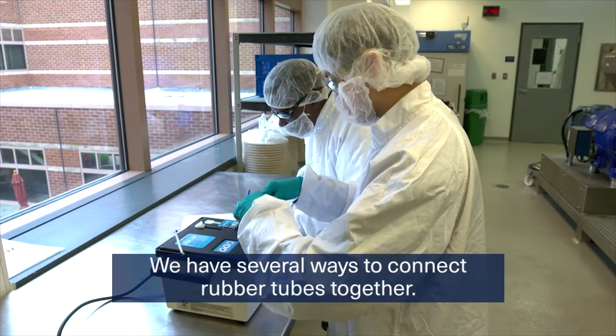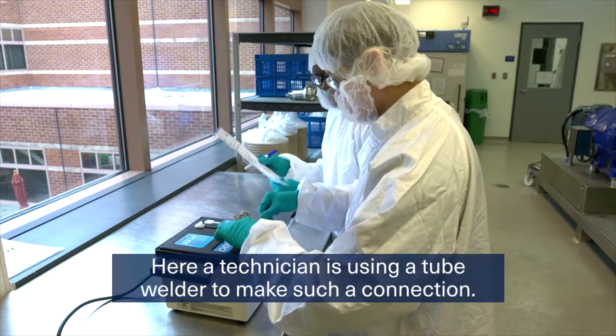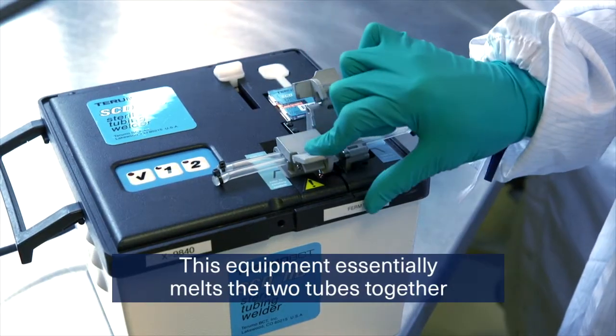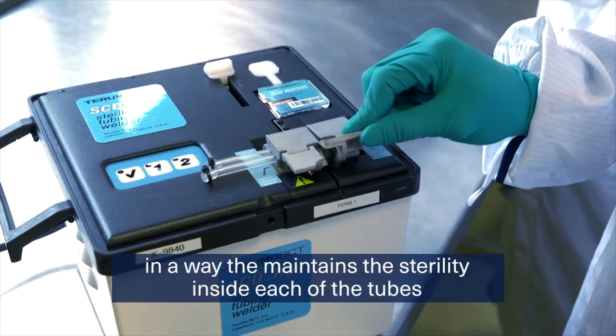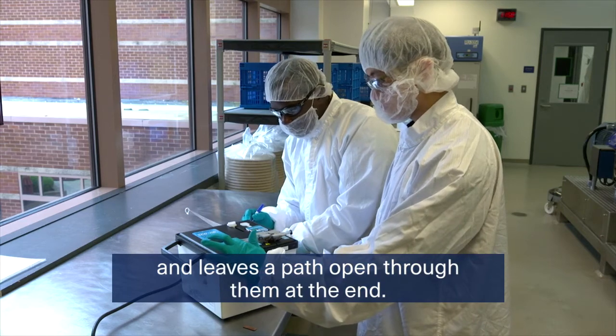We have several ways to connect rubber tubes together. Here, a technician is using a tube welder to make such a connection. This equipment essentially melts the two tubes together in a way that maintains the sterility inside each of the tubes and leaves a path open through them at the end.